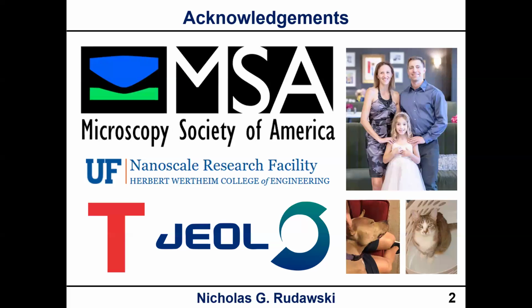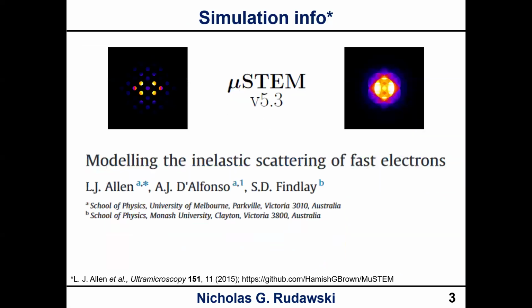So now that we have the acknowledgements, we're going to see quite a bit of simulations of diffraction patterns. I want to share with you where I got this information, where I did the simulation. This is using a software package called MuSTEM. The most recent version is 5.3, and it's based on this publication right here. There's a link at the footnote of the slide where you can get this and run it yourself. It is freely available.